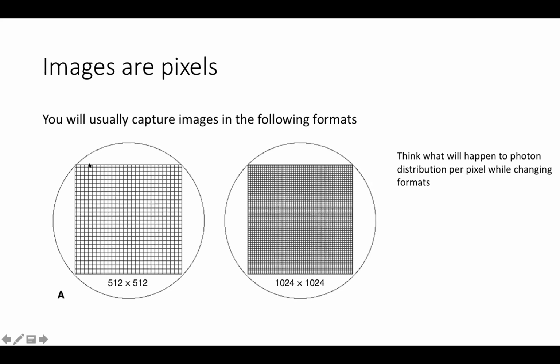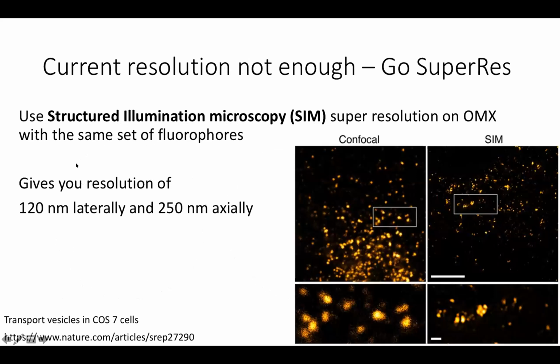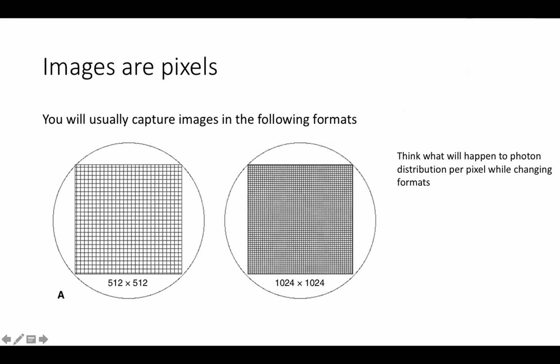Your laser is in fact traveling through each of these spots and you are getting the image, right? So think about it.